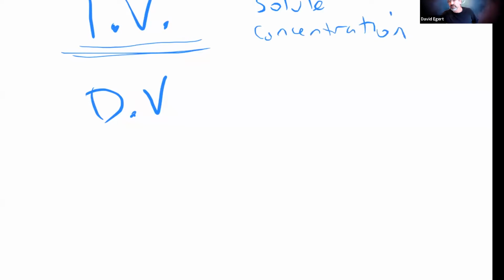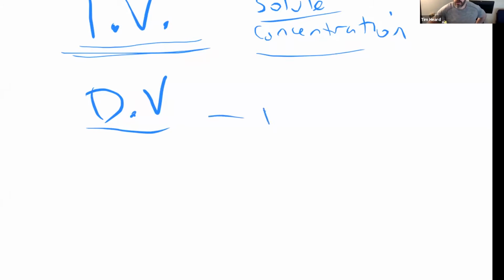Sometimes it's 0.05 molar, sometimes 0.1 molar, sometimes 0.15 molar, sometimes 0.3 molar. So we're varying two different things. What is our dependent variable? What happens to the red blood cells? Yes, basically what happens to the red blood cell.